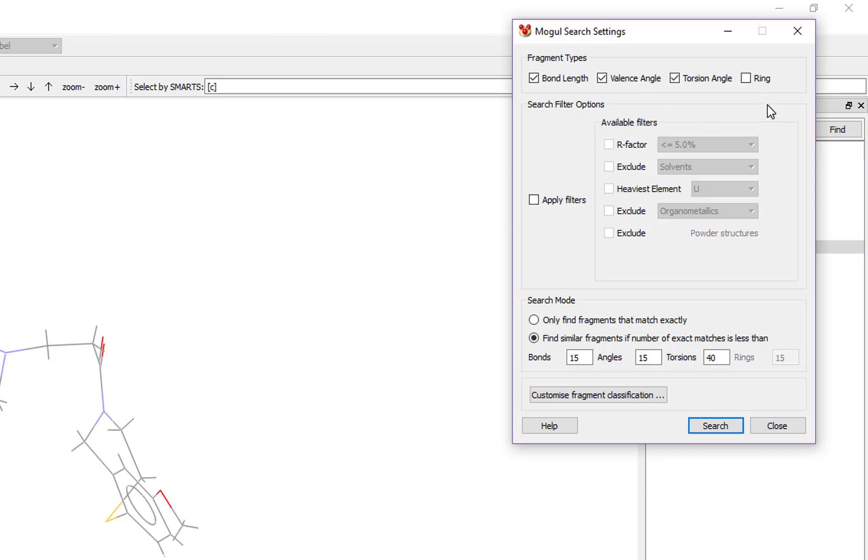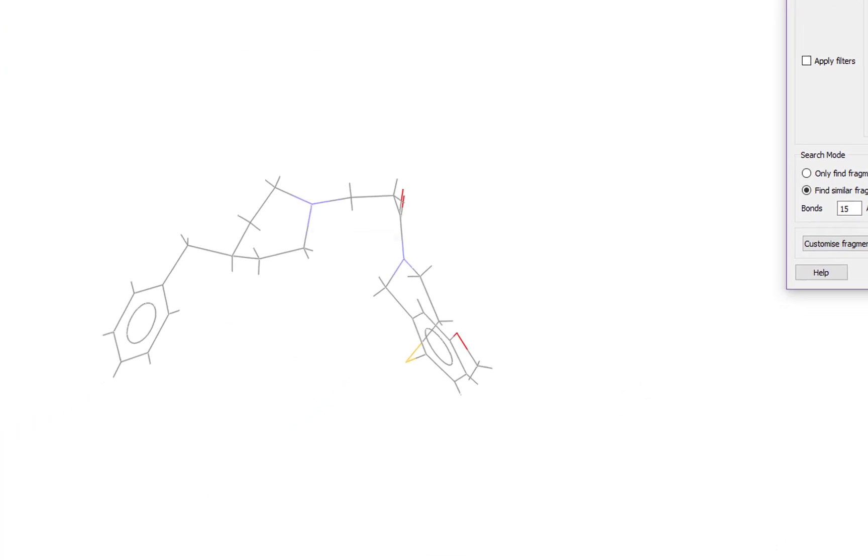The system also allows us to filter the data that we are comparing our molecule to. For this example, we'll take the default and not apply any filters. Once we are happy with our settings, click the search button.